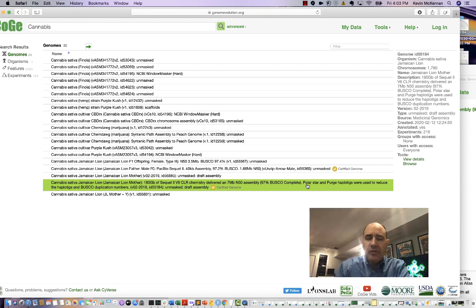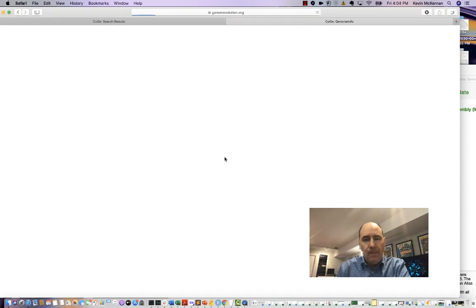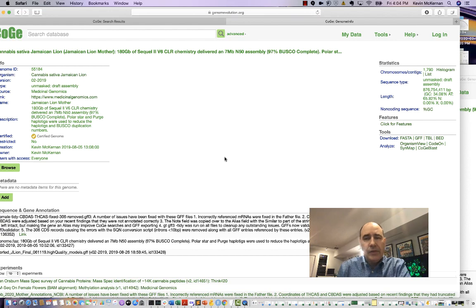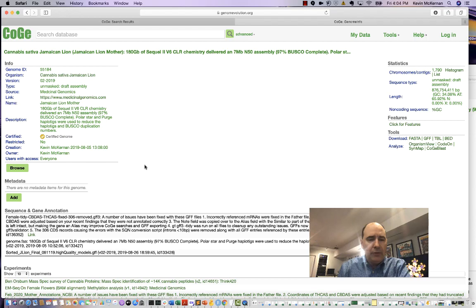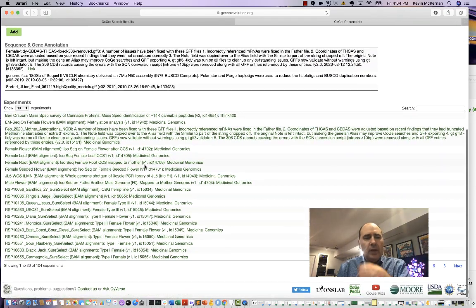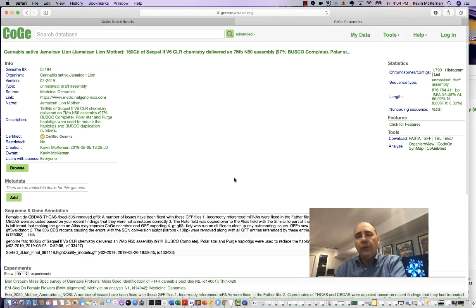Okay, you may see chromosomes from us a little bit later this year, but for the most part, that level of resolution is a little bit academic at the moment. Let's open up one of these browsers. Okay, so we're now into this genome. It will show you there's a couple different annotations that we've thrown in here. It will also give you a handful of experiments that are public and available for you to surf.